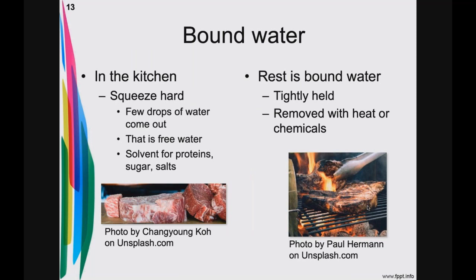In your piece of raw tissue, you really have two types of water molecule. We have water that's known as free water, and there's also water in the tissue known as bound water. Now, to help you visualize bound water and free water, take a piece of raw steak, there on the bottom left. If you really squeeze it hard, pound on it, you'll see some liquid come out. That liquid that's coming out is what's known as the free water. The tissue itself is still moist because the protein molecules and the carbohydrate molecules still have water attached to them, and that's what's known as bound water.